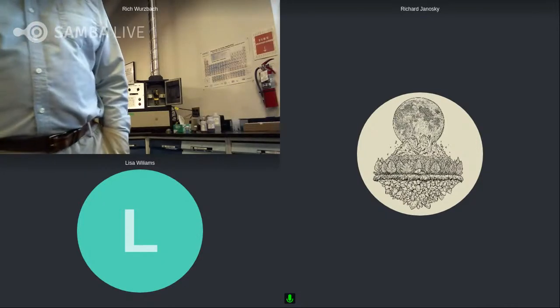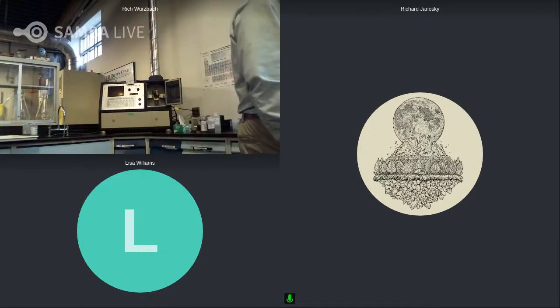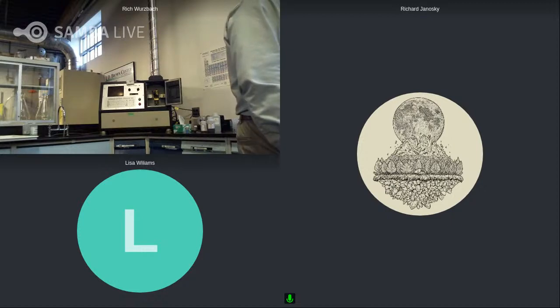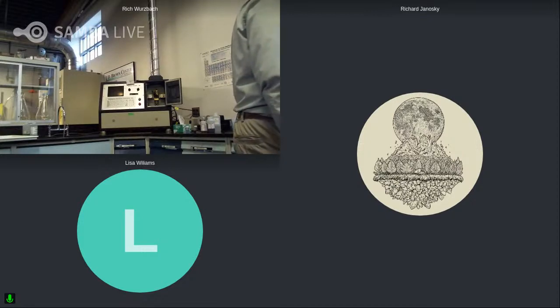There we go. I feel like I looked at one of those greases before on ferrography, and I can't remember, did I see white particles? Is that common with PTFE? Like you could see white, Teflon-y type particles. I remember it forming a pasty kind of residue. And you know, if you're seeing that, you didn't dissolve it right.